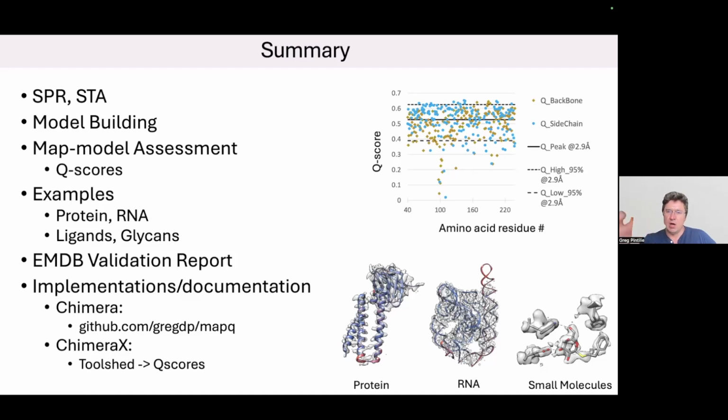The thing with models is even in a small region like this, the number of conformations can be really high, as any modeler can tell you. So the choice of these loops and things that are dynamic, it's pretty tough to model. I think a combination of Ramachandran is good, but one bad Ramachandran angle or residue doesn't mean your model is wrong. So it's hard to say exactly.